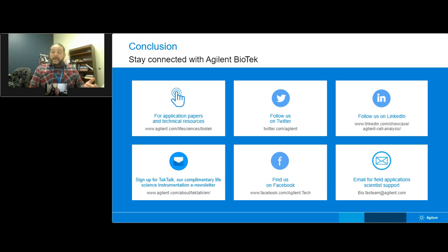So you certainly can use this for live imaging. I think for any given experiment, you would certainly want to optimize the brightness of whatever dye you're using, or fluorescent protein, as well as the robustness of the cell type or whatever live system you're using, to minimize those phototoxicity and photobleaching conditions.